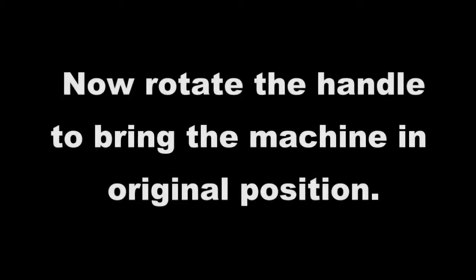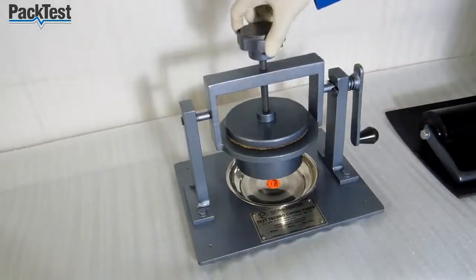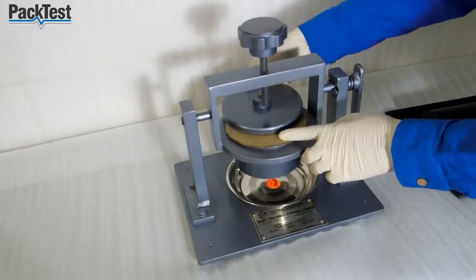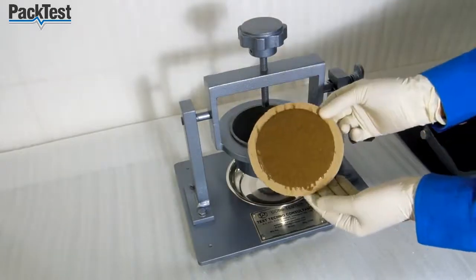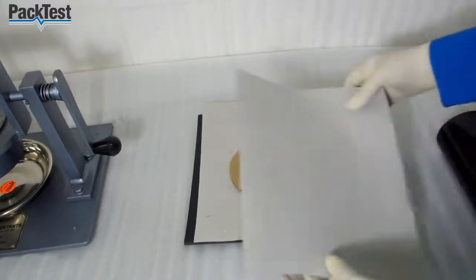Now rotate the handle to bring the machine in original position. Now loosen the screw and remove the sample carefully. Place the sample wet side down between two sheets of blotting paper. Roll the 10 kg roller two times on the paper.